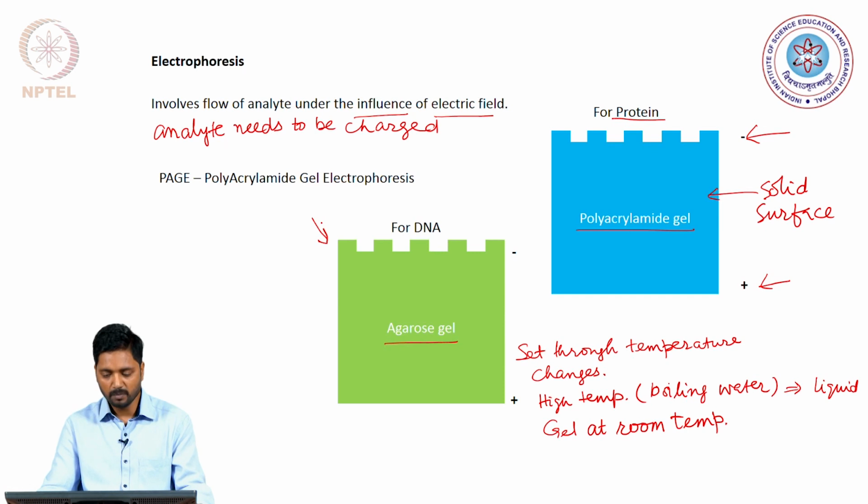The polyacrylamide gel is made through a chemical reaction instead and is not thermoresponsive.